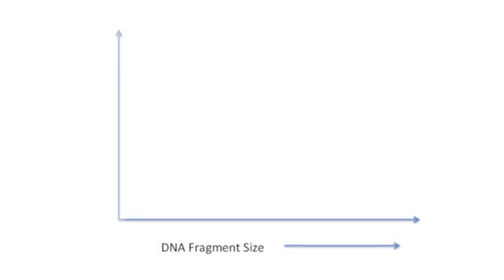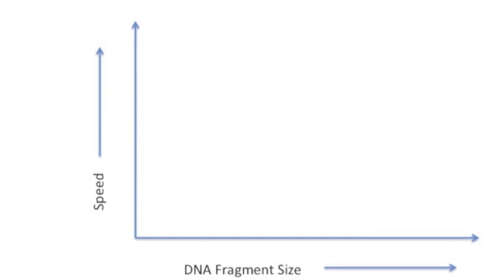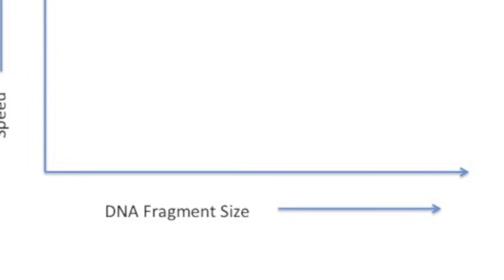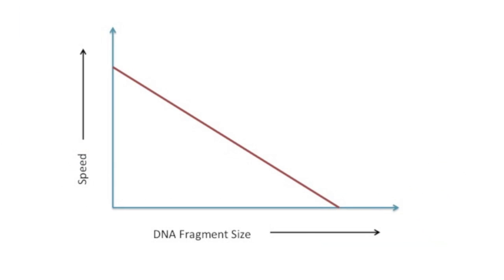If we want to look at a diagram, it would look something like this. The y-axis is speed of movement through the gel, and the x-axis is DNA fragment size. As you can see, there's an inverse relationship between the two. One end shows that the smallest DNA fragment size moves the fastest, while the other end shows that larger DNA fragments move slower.